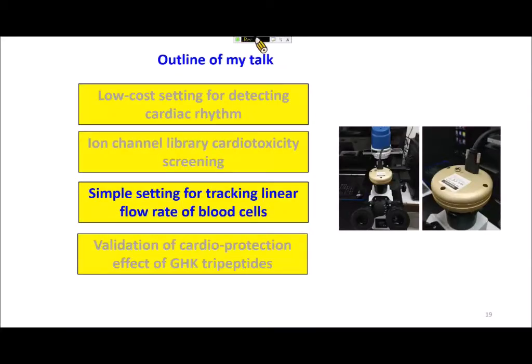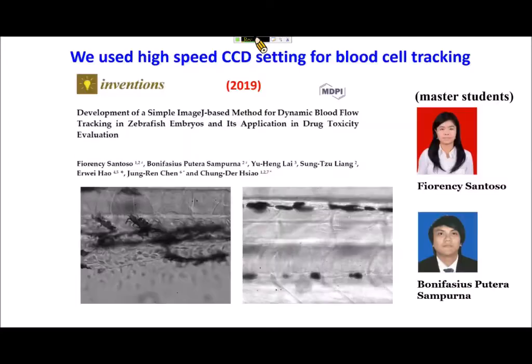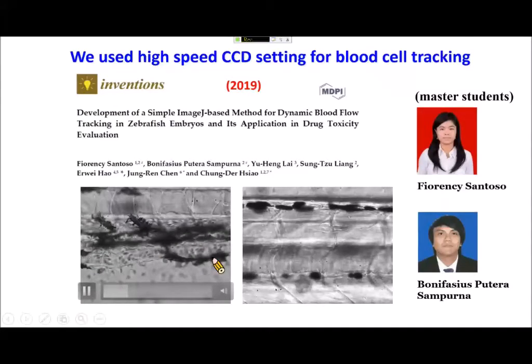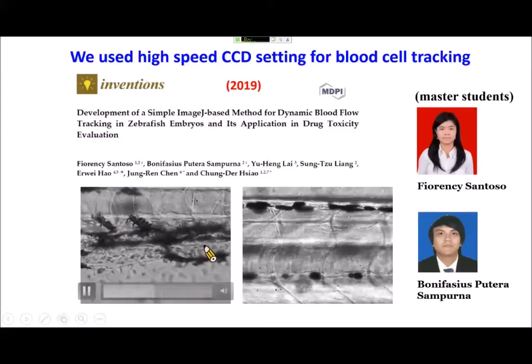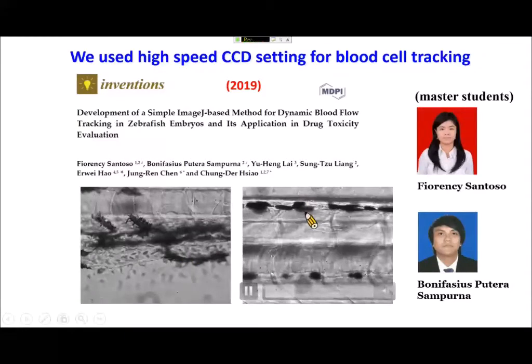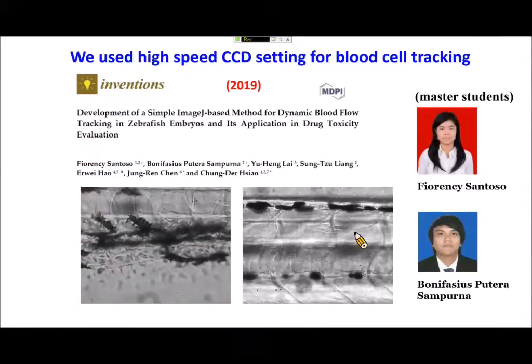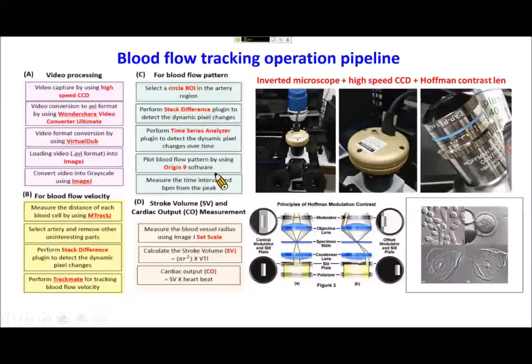Next we moved to blood flow detection. We use a high-speed CCD to record blood flow. This video shows blood flow in the dorsal aorta and posterior cardinal vein. After slowing down the frame rate, you can see blood flow in the artery and vein, and even single red blood cells in the capillary. Using this high-speed CCD, the resolution is very good and we can observe the detail of blood flow. This work was done by my students Phil and Bonnie.